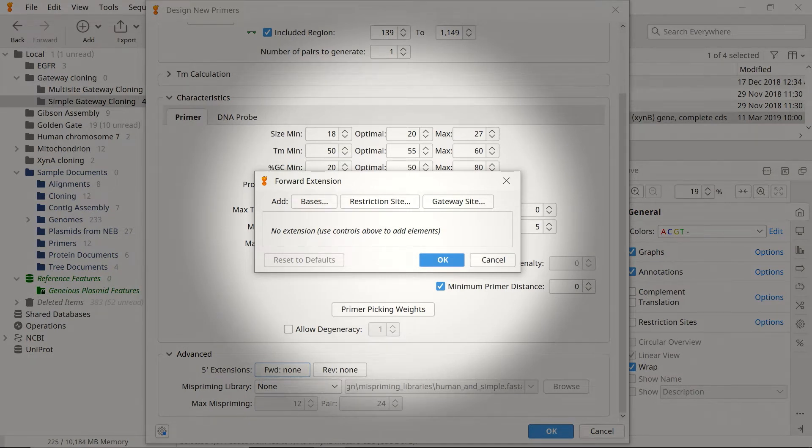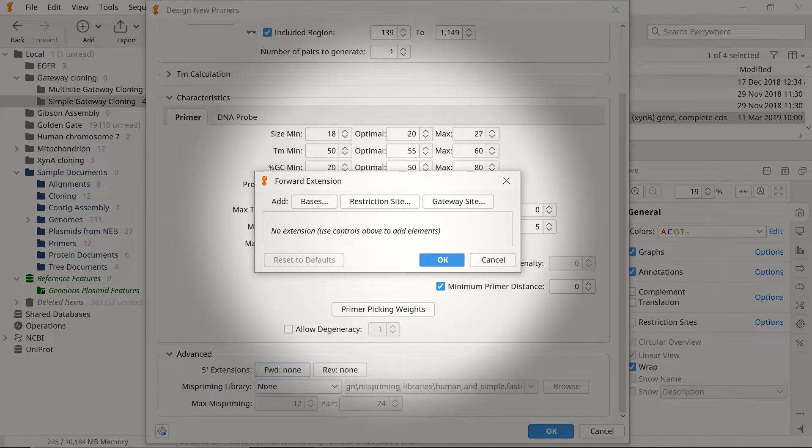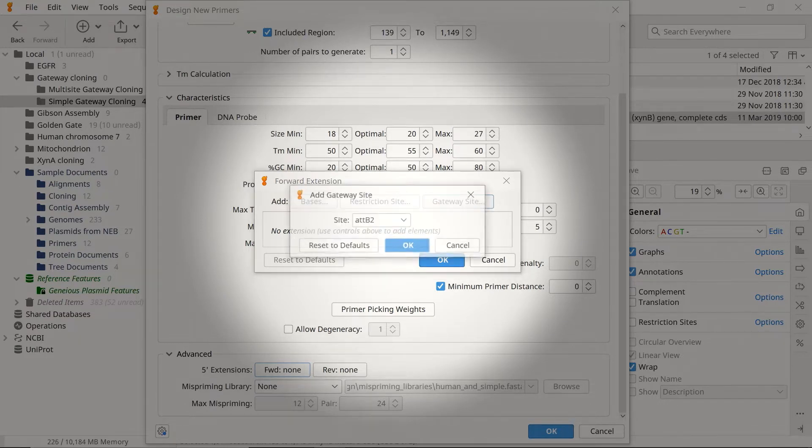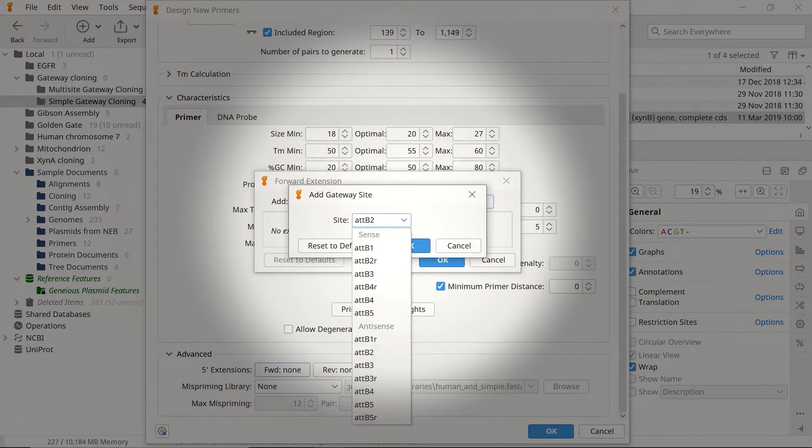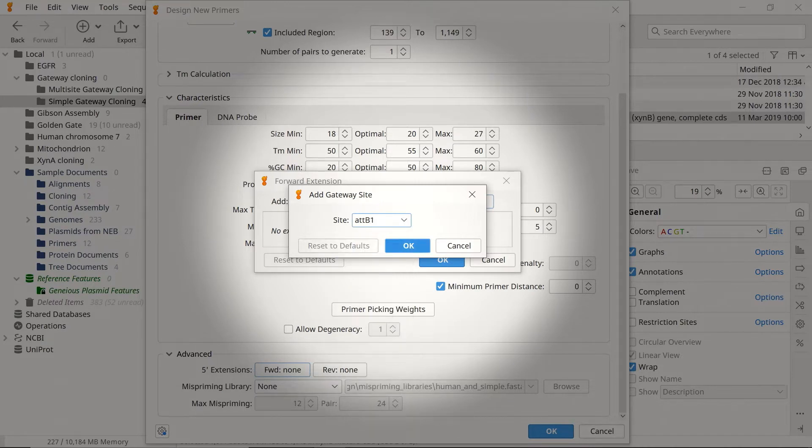Genius has many extension options available, but for gateway cloning, select the Gateway Site option. Next, use the dropdown menu to select your desired site. For simple gateway cloning experiments, choose the attB1 option on the Sense strand. Click OK.